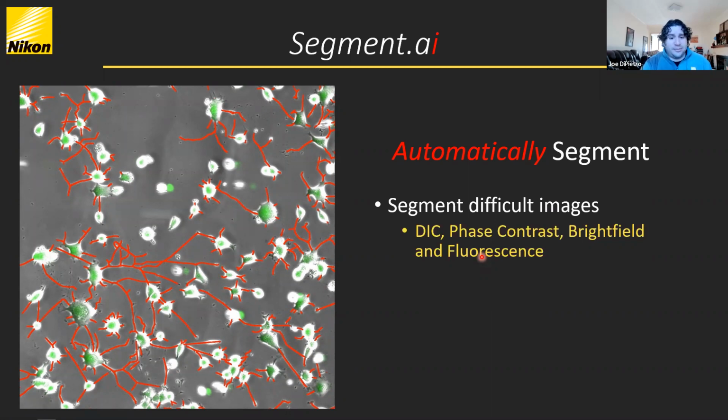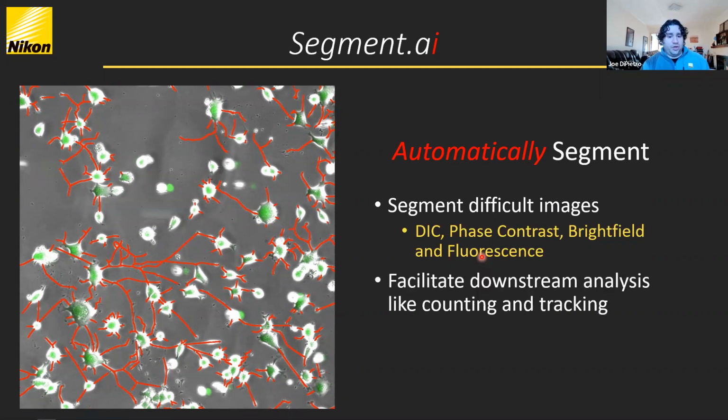It doesn't even have to be fluorescent images. You could do DIC images, phase contrast images, anything that captures what you want to segment, and you can train it. And it doesn't have to be branchy segmentation like this. It could be identifying a rare cell type amongst a bunch of other cell types. Maybe you have a dish with two different cell types in it, or a tissue that has multiple cell types, and every once in a while there's the cell that you're interested in.